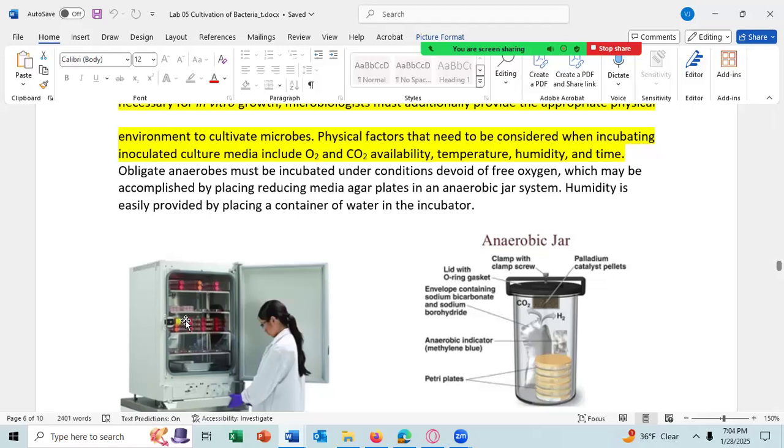After that, the plates will dry out and the bacteria will die. But if you put the pan of water in there and have humidity in the air in your incubator, the plates can go for at least a week. Sometimes they can even go for 2 weeks. And that's important. Anyways, those are our simple incubators.